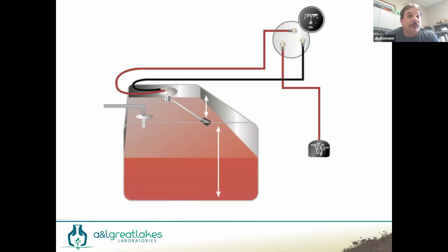But as you can imagine, if we use a weaker acid, say Bray, which is the traditional extractant that has been used in the university realms and in public areas prior to Mehlich 3, those numbers are 20% lower. Well, if I try to use an interpretive chart, I have to use one specifically for Bray. If I cross over, that 20% difference in data value will potentially skew my nutrient application by 20%. And there's economic and environmental impacts to those things.